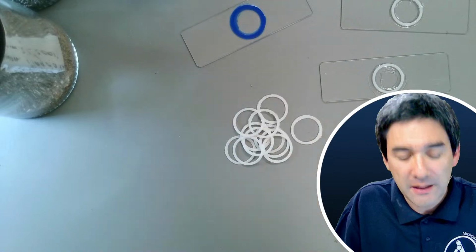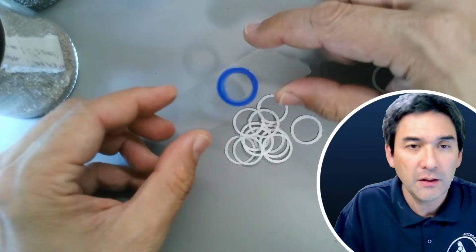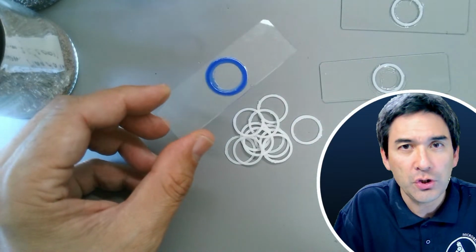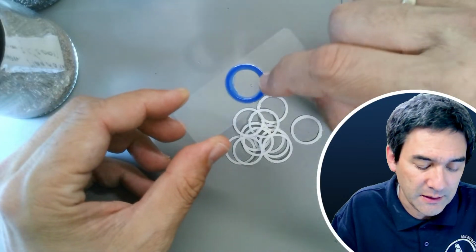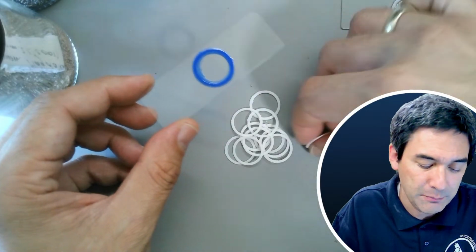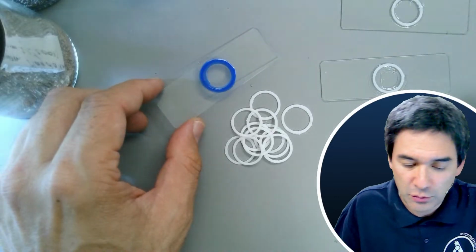And I would like to also show you how to use a so-called slide ringing table. A slide ringing table allows you to make those so-called spacer rings here. And I'm using nail polish. Why am I using nail polish? Because it dries quickly. But then I found out that essentially it's not thick enough. For this reason I 3D printed some of those spacer rings here, and I would like to try that out.